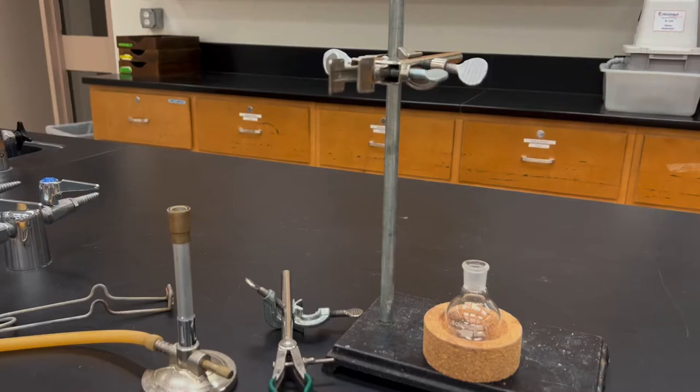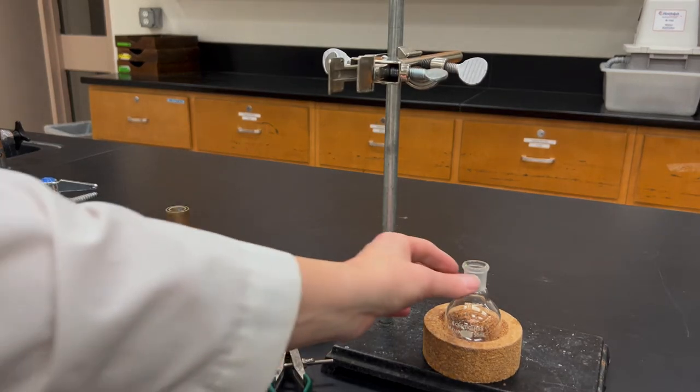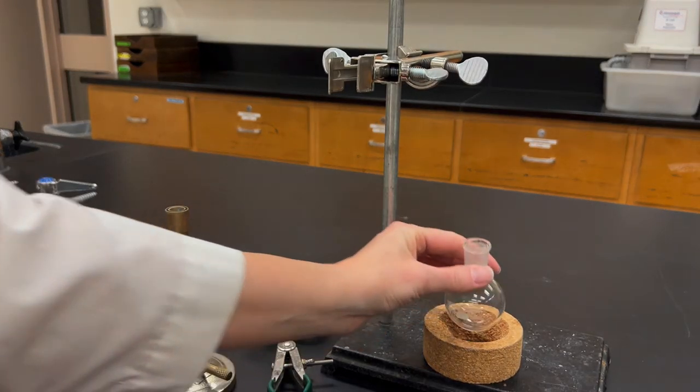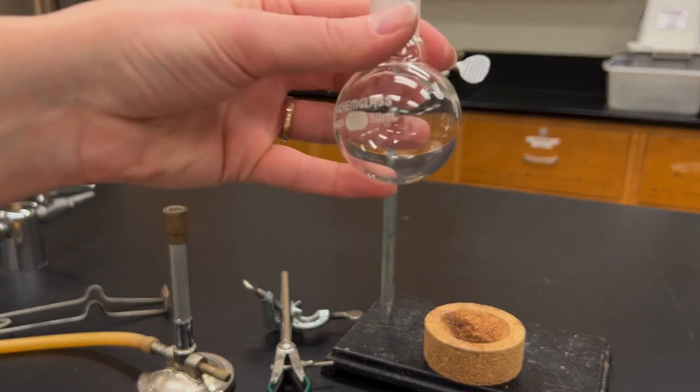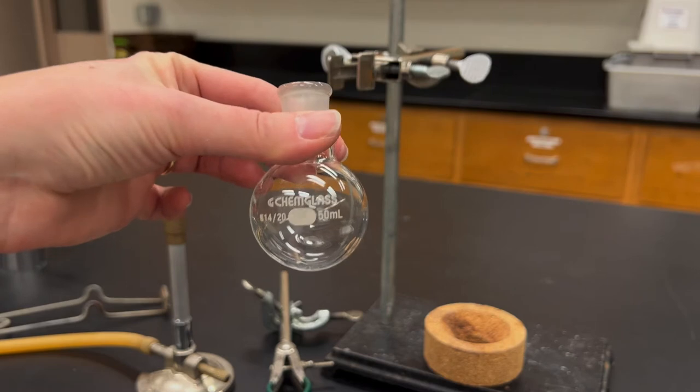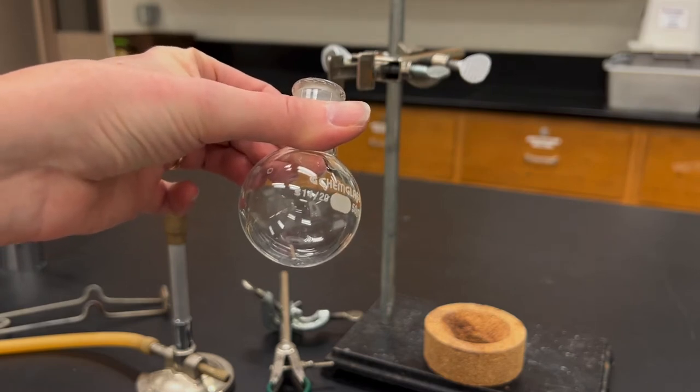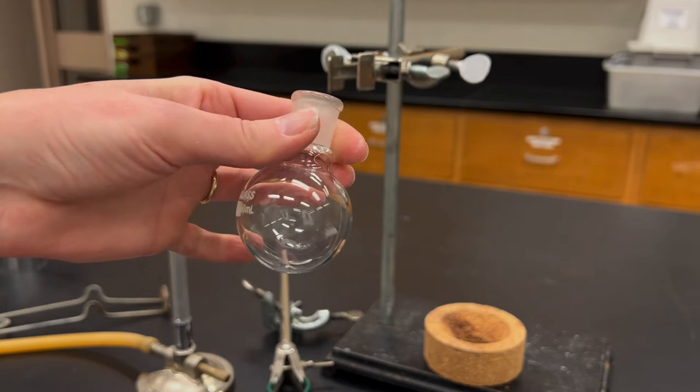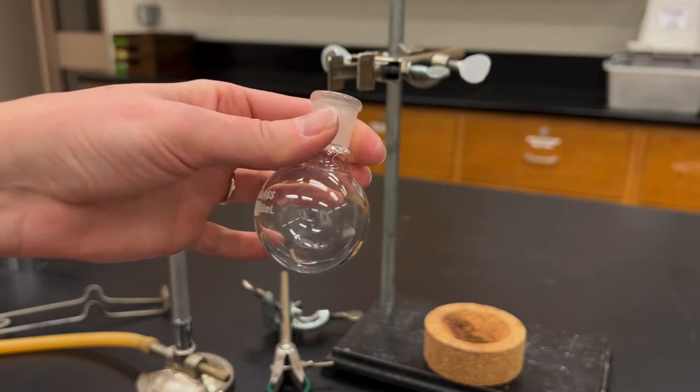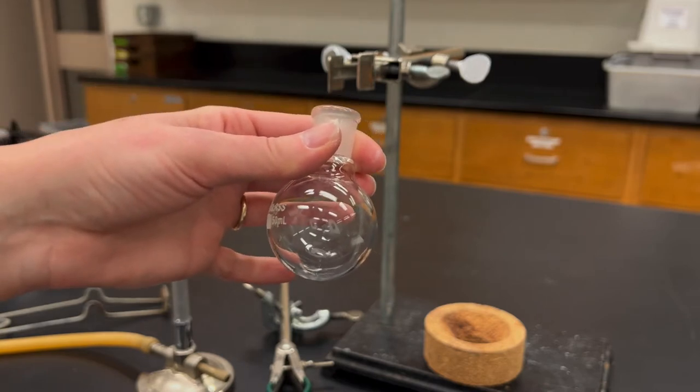Next I want to get my flask ready. If we're trying to exclude water from a reaction we do have to take into account that glass is quite polar and actually has a surface coating of adsorbed water. So we need to remove that. Options are you could either have your flask heated overnight in an oven to boil away that water, or you could flame dry it. And so I'm going to show you how to flame dry a flask.